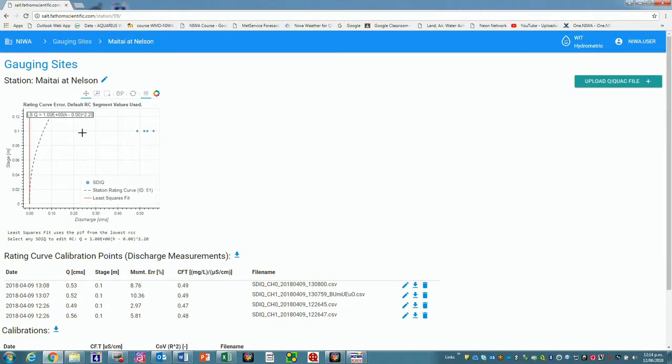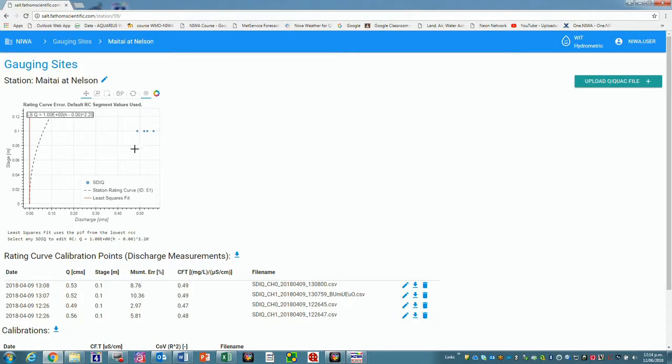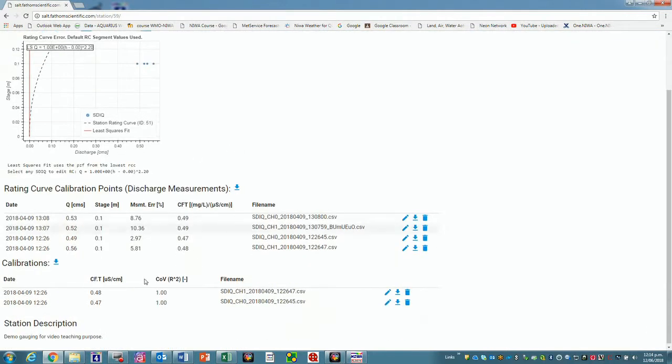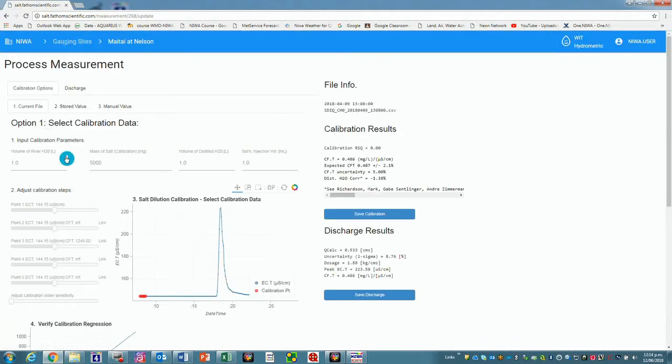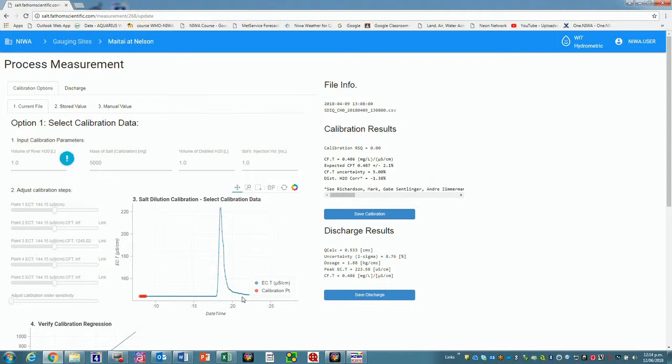This graph here would attempt to plot the four on a rating curve, but because the stage never changed, it's struggling to do that. But if you had several, it will give you a nice curve. So if we look at one of these, for instance, if we go to this first measurement here. So it's coming up with a nice display here of the actual discharge or dilution gauging we've just carried out. This is just for the one probe member, and we've got here, you can see the results of 533.